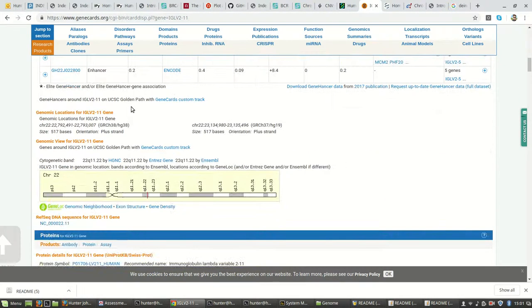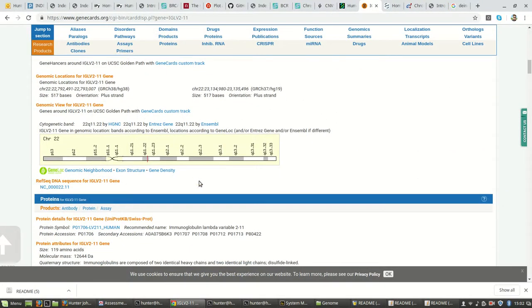What I wanted to do was get to the Genome Browser view. And this is something that I began to understand today. A chromosome has this little pinchy part in the middle, which is where the microtubule grabs it during mitosis or meiosis, and it's called the centromere. Each chromosome has a short end and a long end.